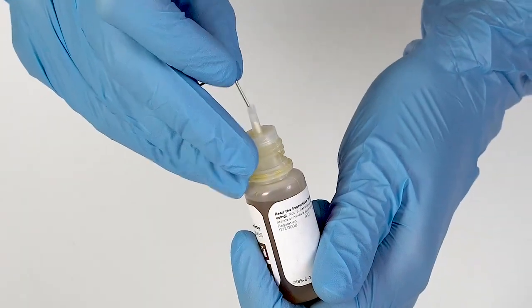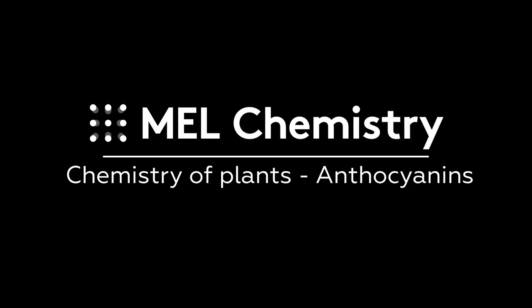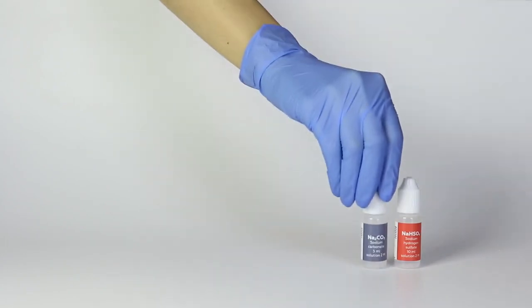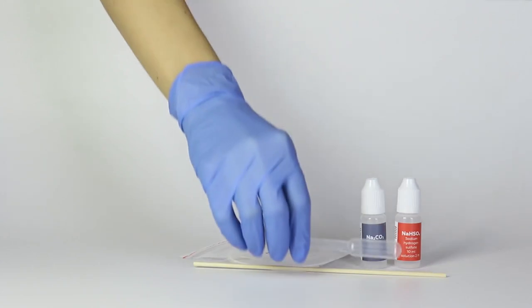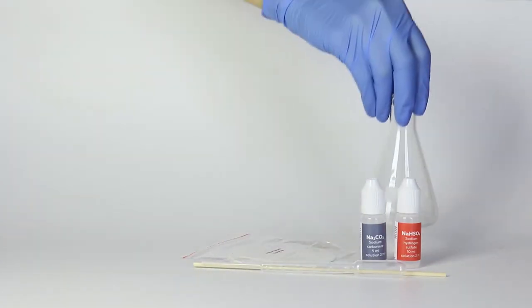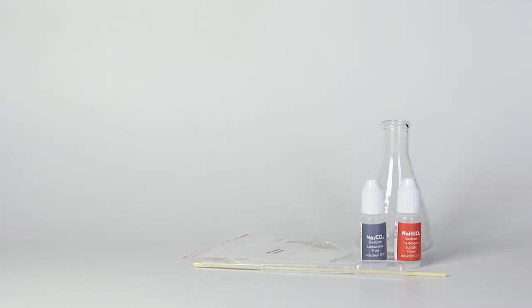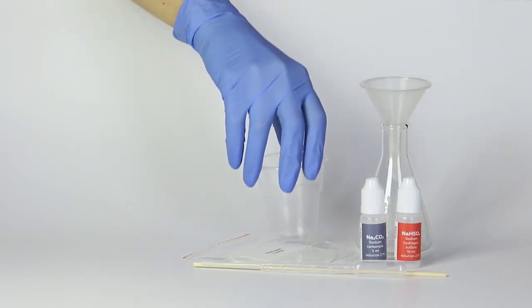Pierce the bottle nozzle with an unbent paper clip. For the anthocyanins experiment, you will need solutions of sodium hydrogen sulfate and sodium carbonate, filter paper, a wooden stick and a pipette. You will also need the flask, the funnel and two disposable cups from your starter kit.